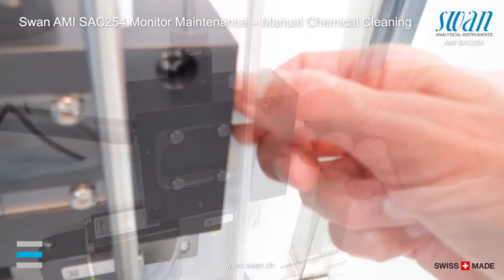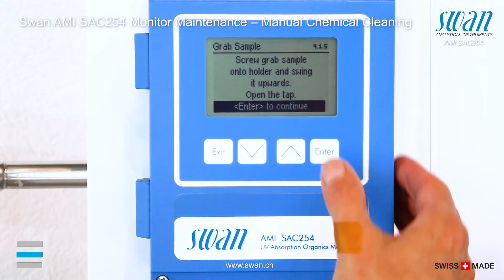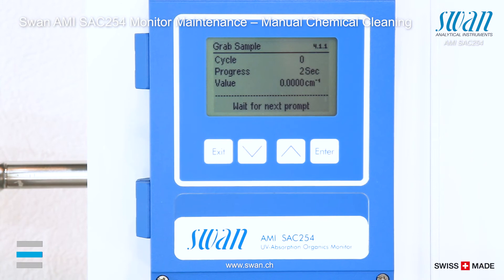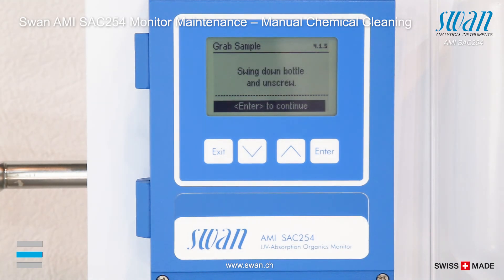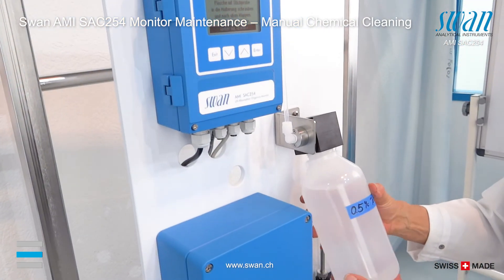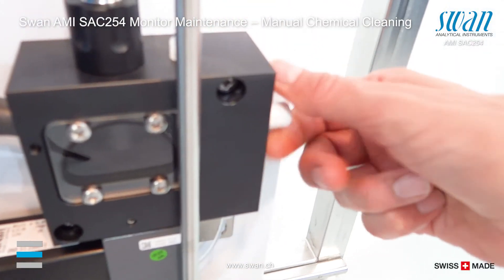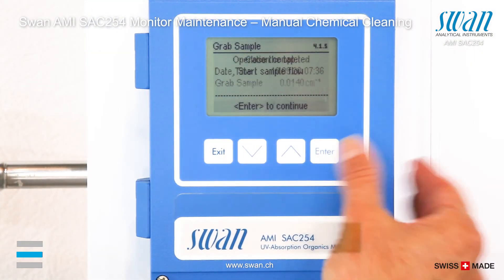Screw the bottle with the cleaning solution onto the holder and swing it upwards. Open the tab. The manual cleaning takes about 10 minutes. After the procedure is finished, some of the liquid might still be left inside the bottle. Swing the bottle down and unscrew from the holder. Close the grab sample valve on the flow cell block and start the sample flow again. Discard the recording by pressing exit.